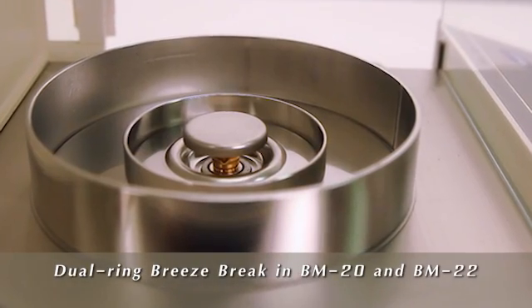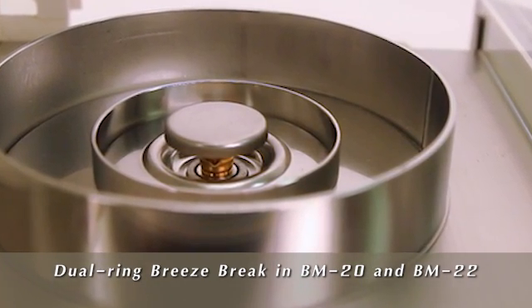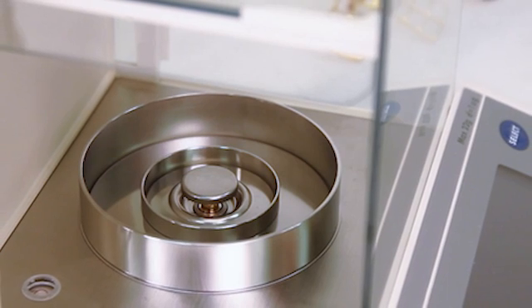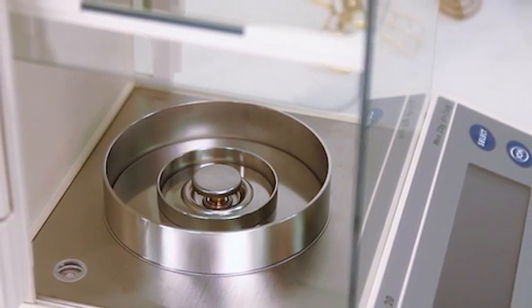The innovative dual-ring breeze break reduces drafts in the BM20 and BM22 microbalances. This feature makes a secondary inner chamber unnecessary to achieve microgram readability, giving A&D's microbalances large weighing chambers.